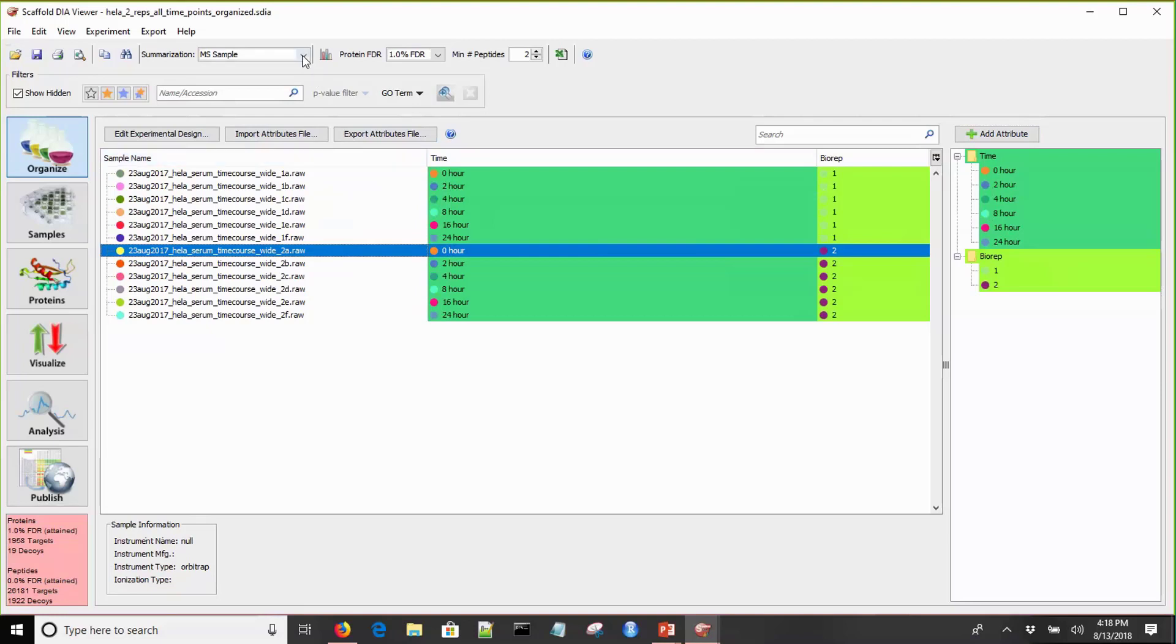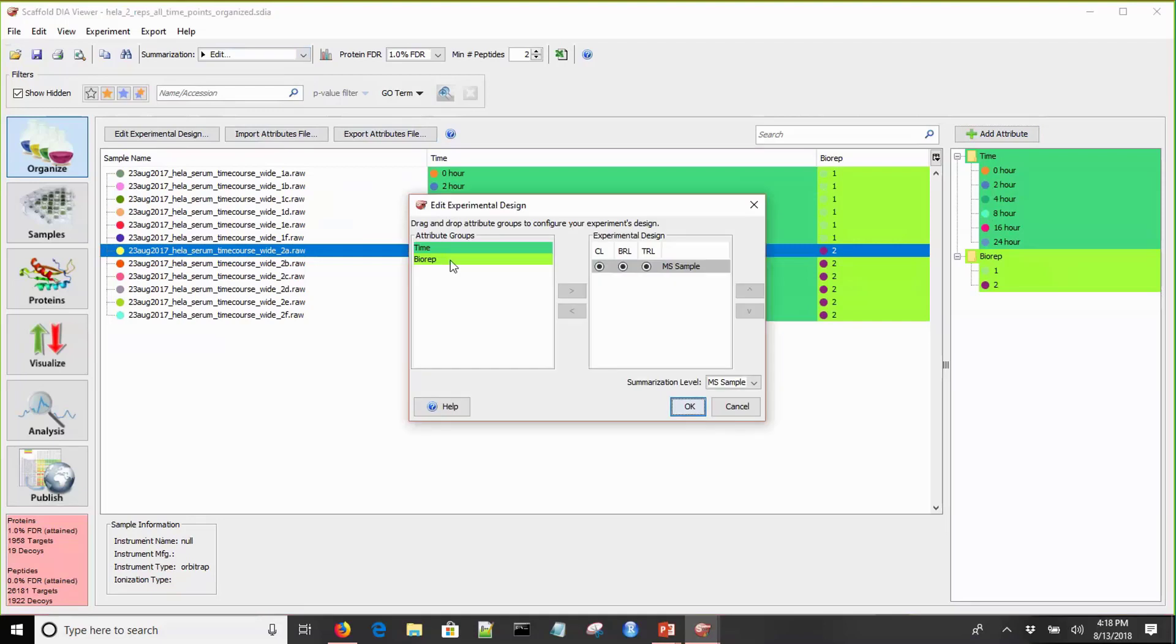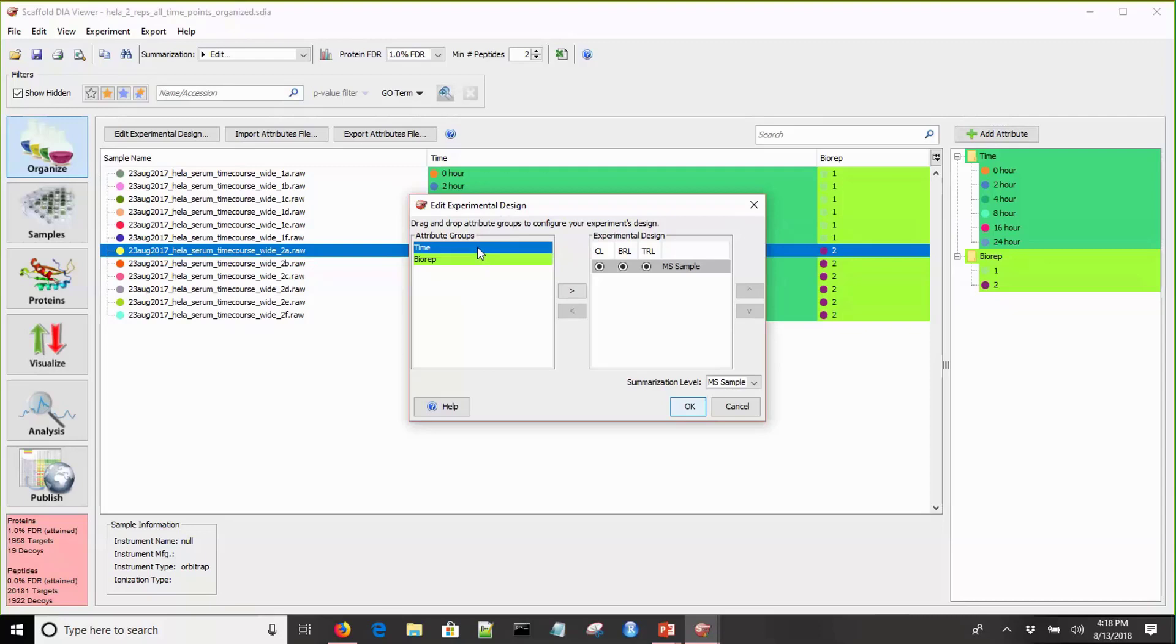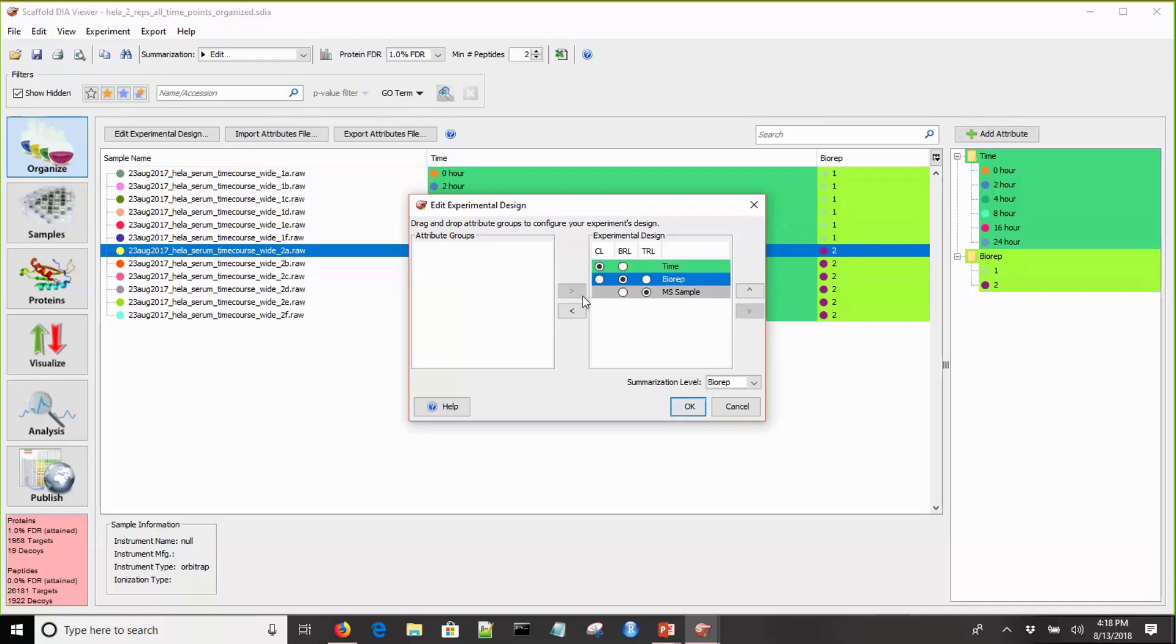Now we're almost ready to start looking at some data, but before we do, we need to set the summarization level. The summarization level allows for the proper rollup of samples within categories and allows you to do statistical analysis properly. I clicked on the summarization drop down and went to edit. This brings up the edit experimental design box with attributes on the side and the experimental design on the other side. We need to move these individual attribute groups from one side to the other to add them to the experimental design. The arrows in the middle do this, and the arrows on this side control the hierarchy of your attribute groups. You want to make sure that this matches your experimental design properly. Since this is a time course study, we want to have time on top, then biological replicate under it, and then sample under that.